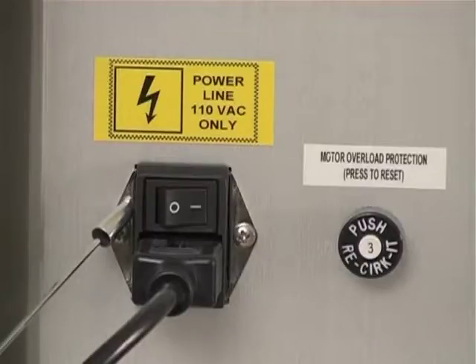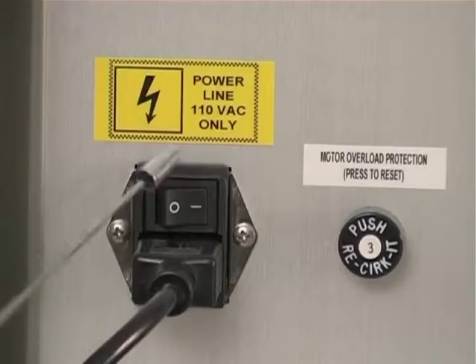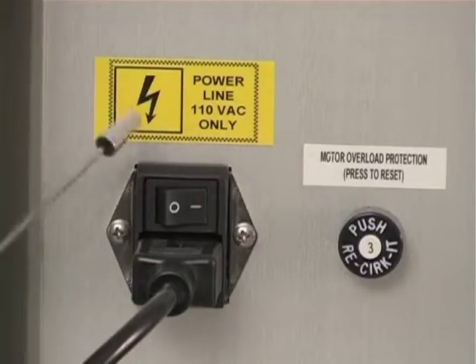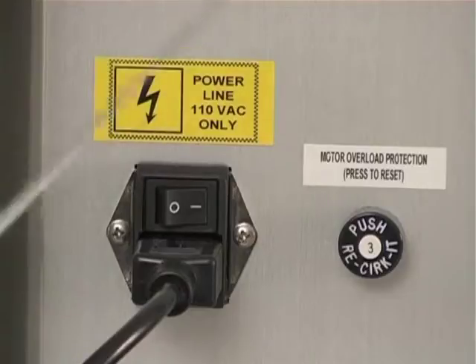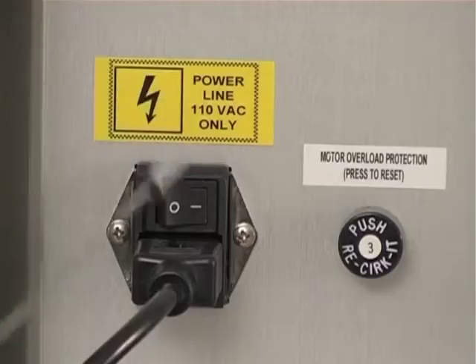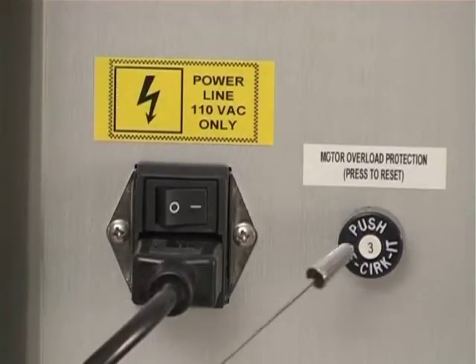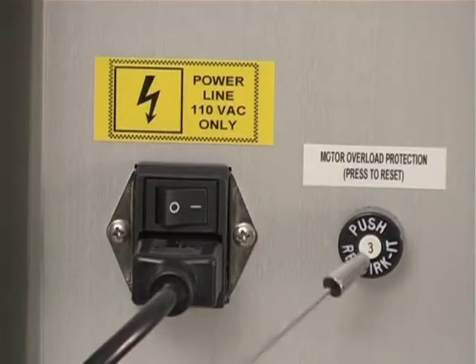This is the power connection — the cord is connected here. This is the on-off switch, and this particular machine works on 110 volt AC; it can also be connected to 220 volts AC. You should be careful when plugging the cord in so that you do not get an electrical shock. This one here is the overload protection fuse — if it blows, you just press this button to reset it.